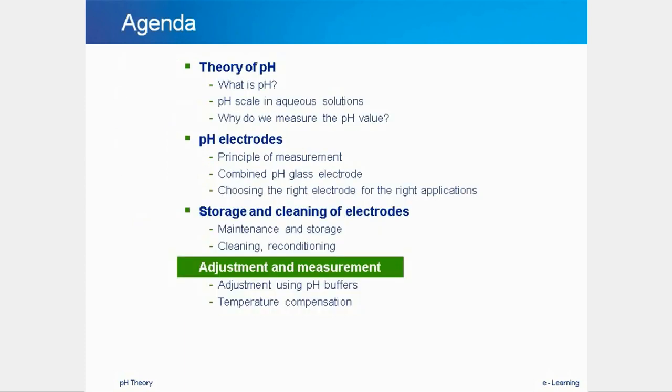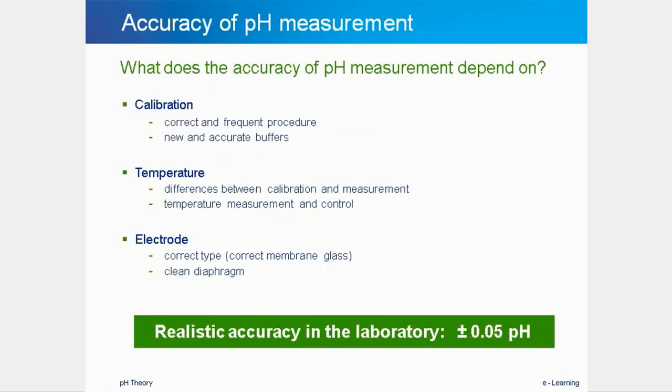Now that we have seen what the pH theory is, how the equipment technically works, and how it should be handled between and before use, we finally get to see how to actually perform a measurement and the required calibration to get a reliable result.